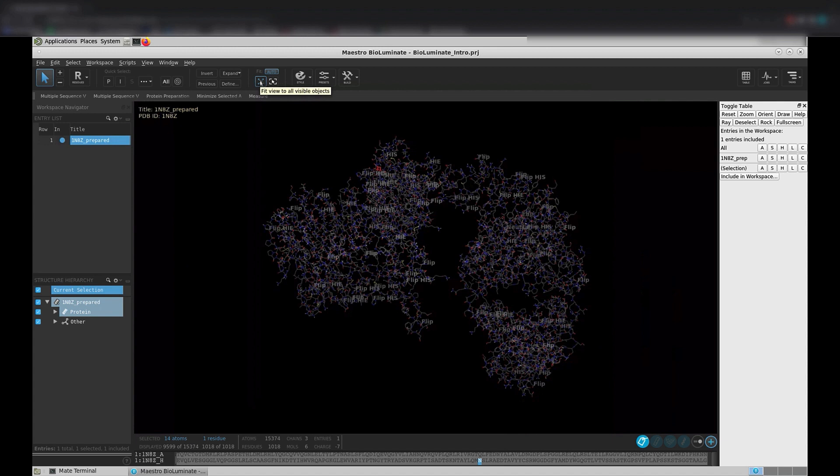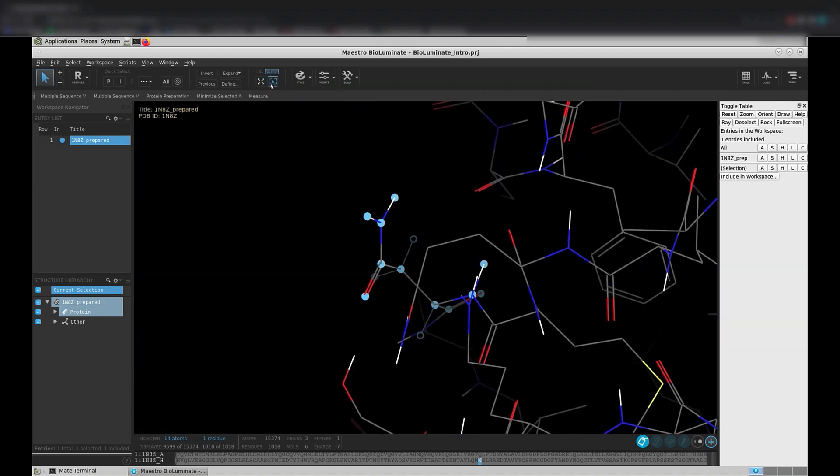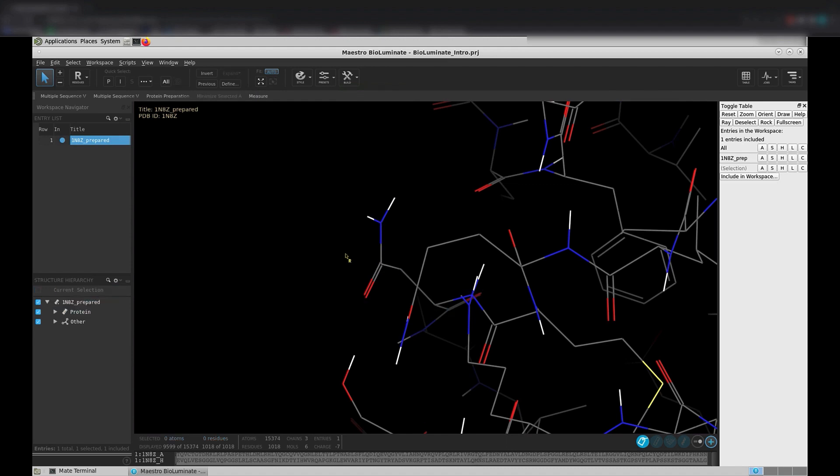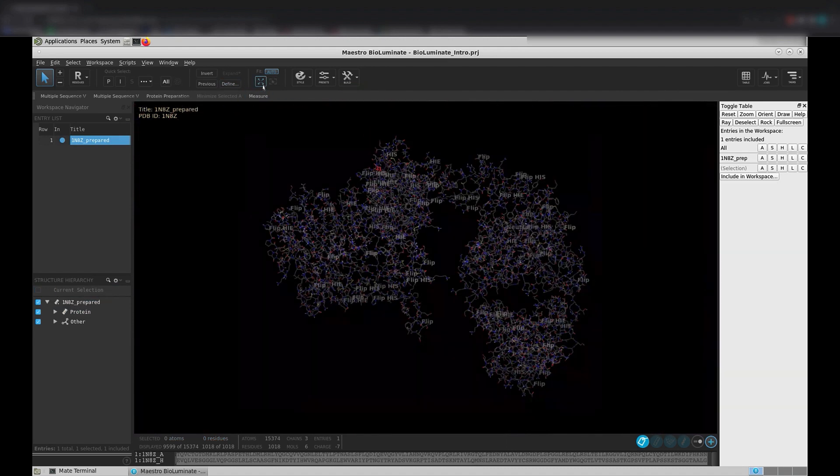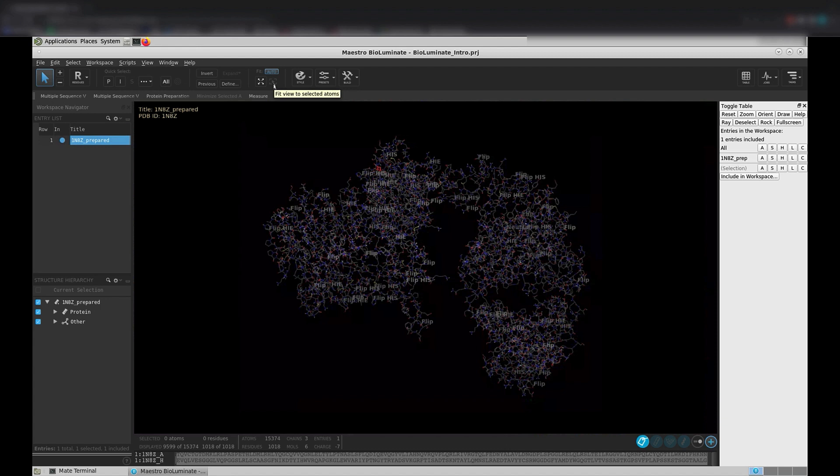Likewise, you can zoom in to just a group of selected atoms. Notice that buttons in BioLuminate will become active or inactive depending on what is in your workspace. For instance, if we don't have any atoms selected in our workspace, this button isn't active. You can use this visual cue to help you know which buttons to use, as well as hovering over buttons to use a tooltip to remind you what they do.